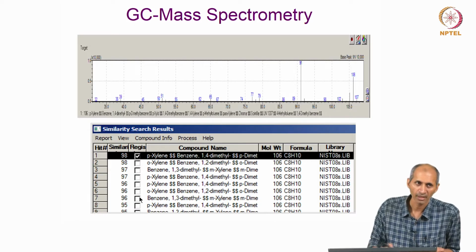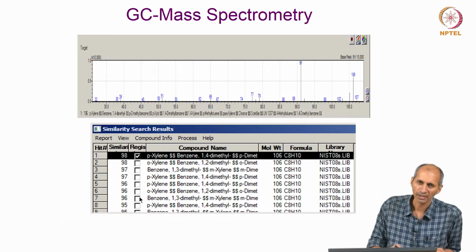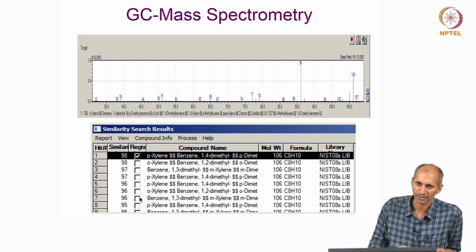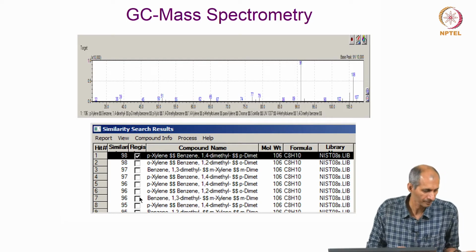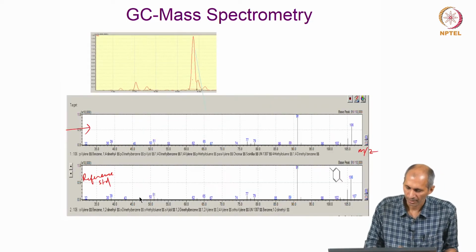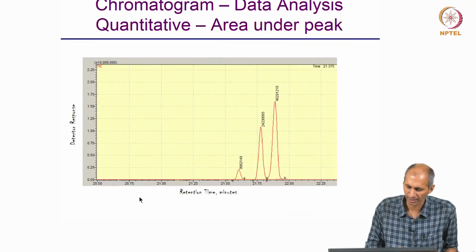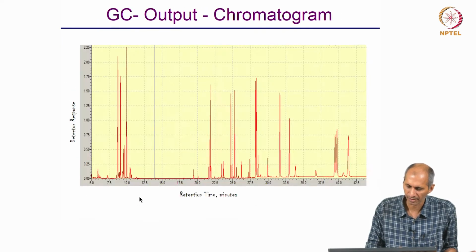So, this is the way mass spectral GCMS is used. If you have a new compound, you need the spectra for that and you will compare, most of the times. So, in yesterday's lectures we had talked about quantification, we will look at that a little bit.